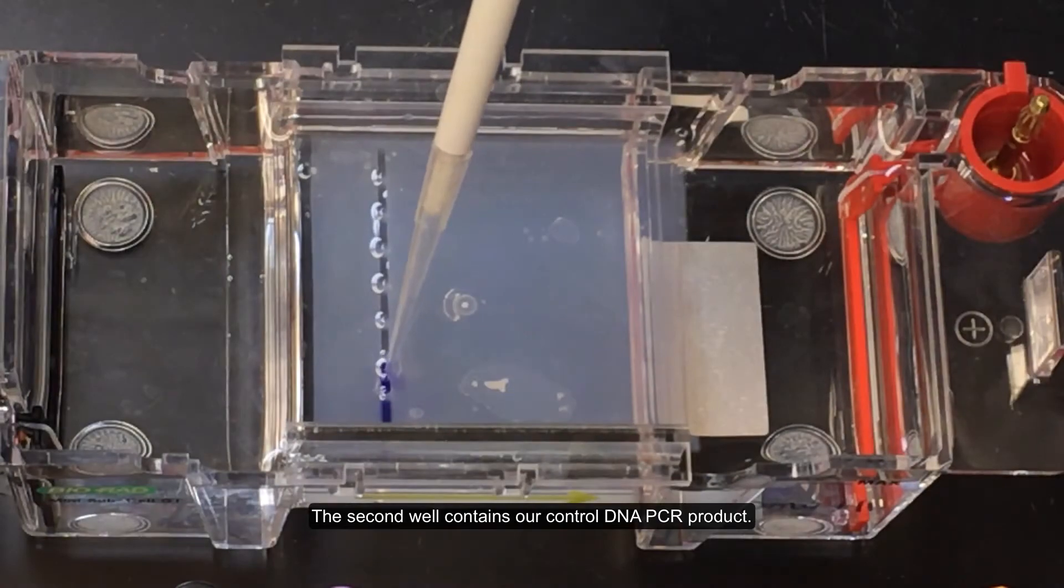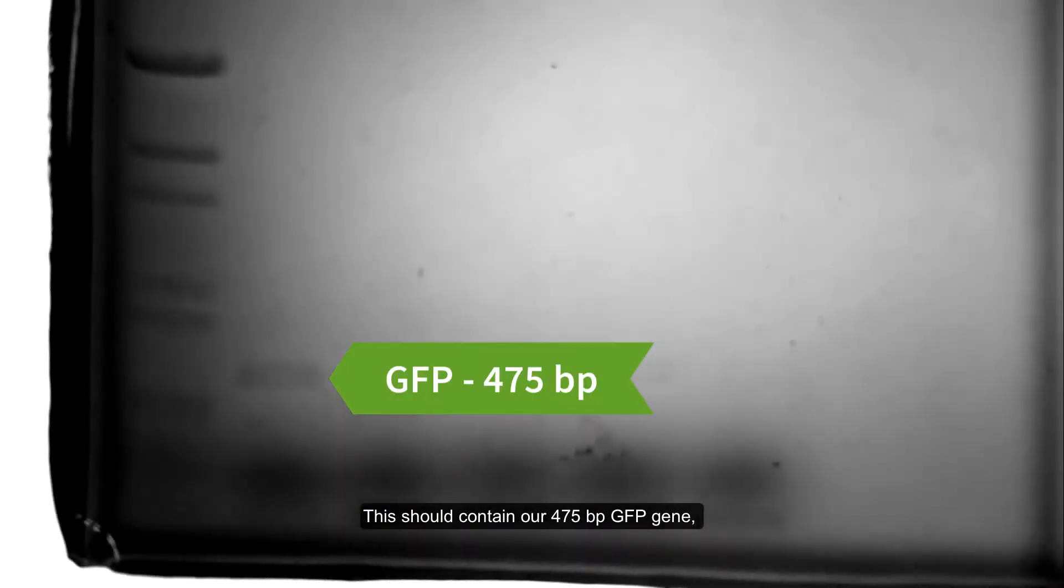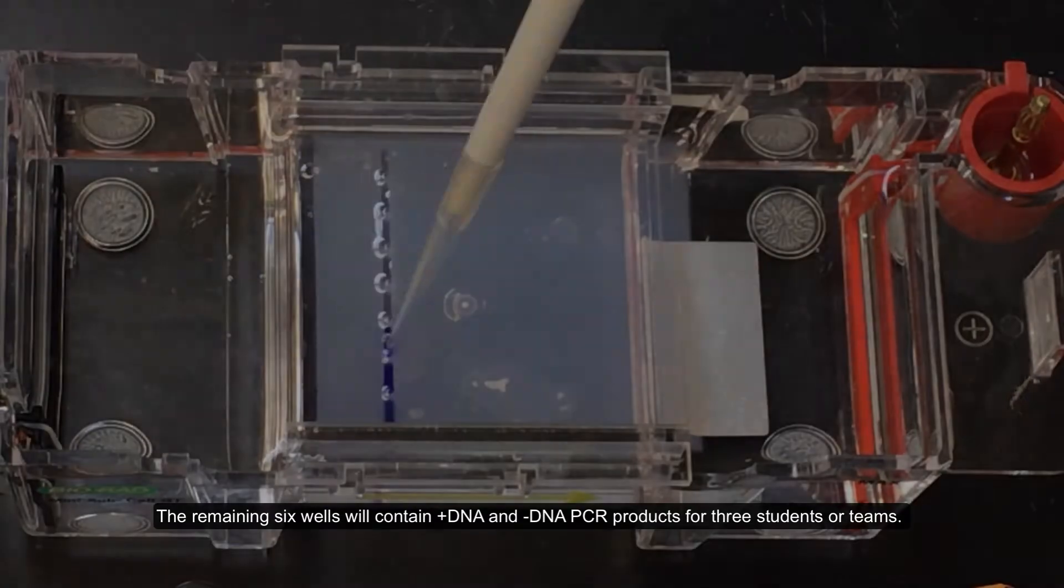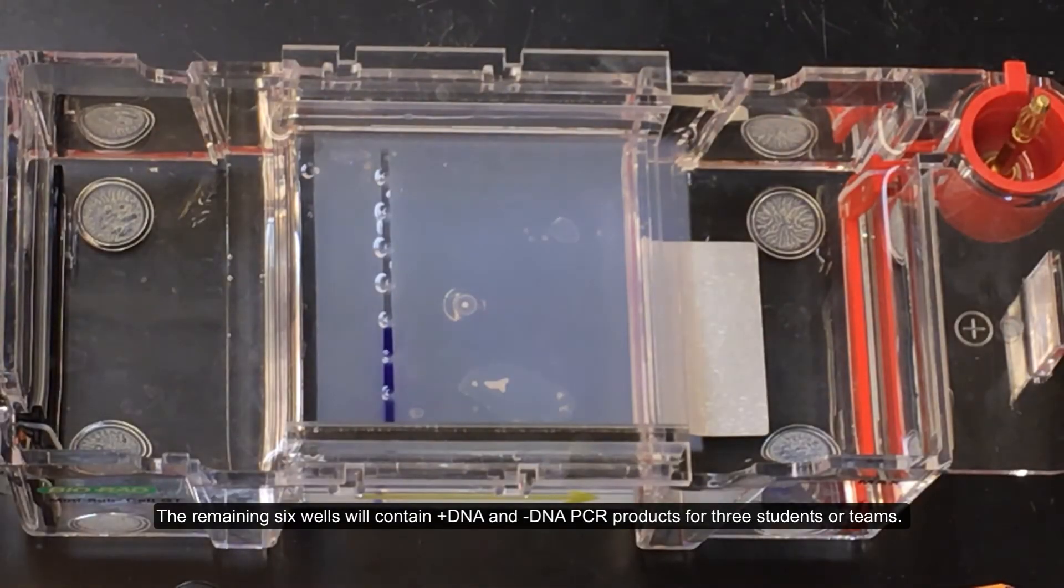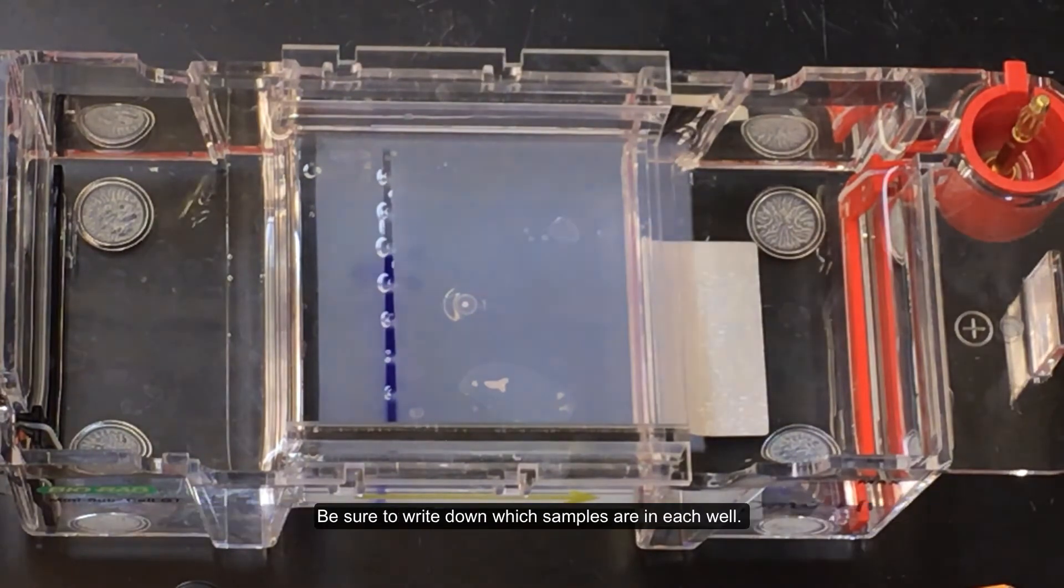The second well contains our control DNA PCR product. This should contain our 475 base pair GFP gene and a 190 base pair bacterial housekeeping gene. The remaining six wells will contain plus DNA and minus DNA PCR products for three students or teams. Be sure to write down which samples are in each well.